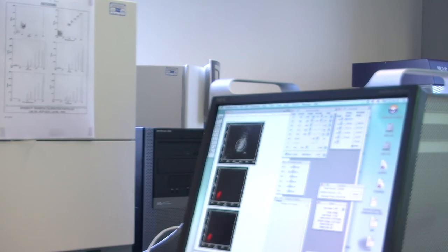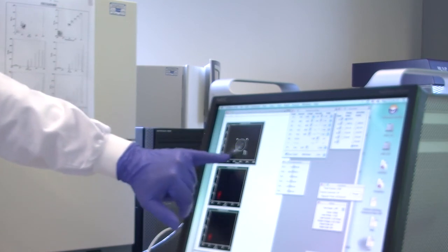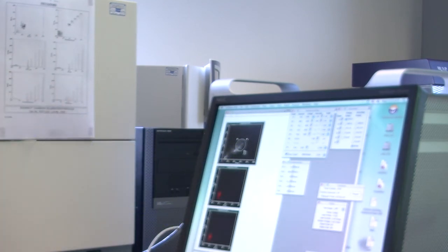So it stops. We can then put our next tube on. And there is still liquid left. Yep, that's it. Which is good. Now you can see the previous ones were nicely in that gate. This one comes down here. So many of these cells are smaller and less granular than the previous cell line. And that's not a problem at all. All it means is that this cell line has a different size and granularity profile to the first cell line.